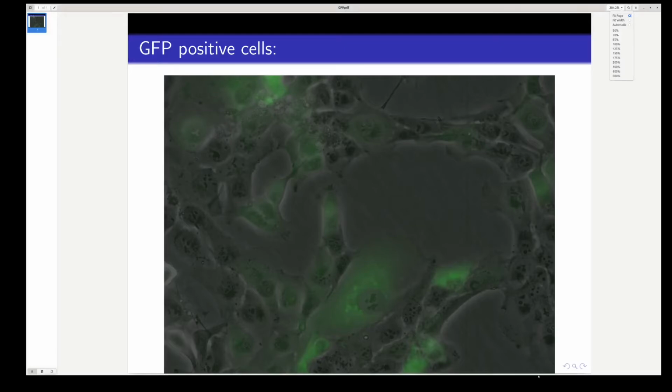Hi, so here are some GFP positive RCTE cells. This is not a very good electroporation. Usually they're 80 to 90% positive. Here they look about 40 to 50. It's still good enough to go on and work with your Cas12a CRISPR electroporation. Thank you.